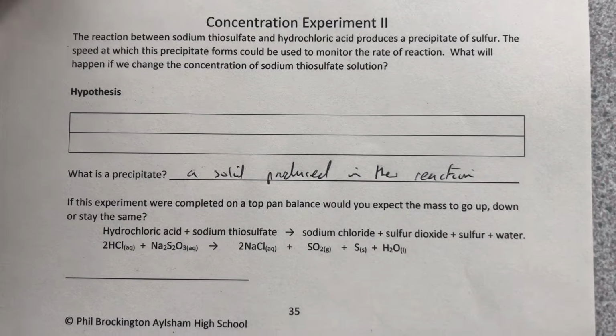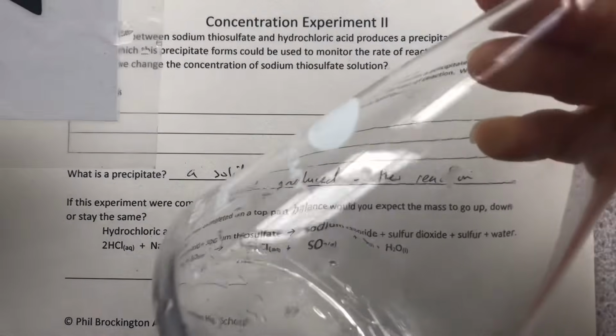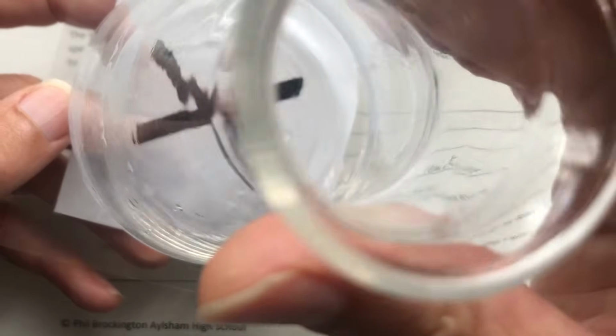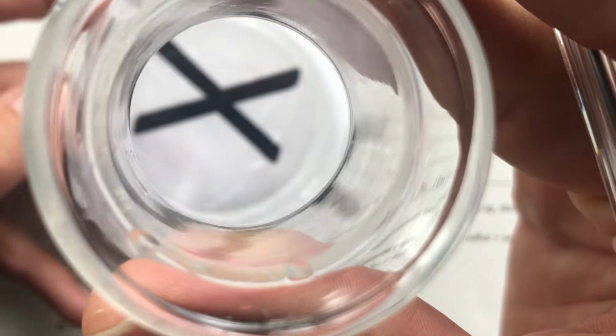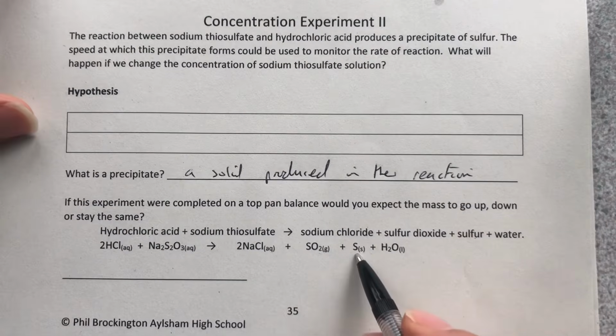So what we're going to do is put the reagents in a conical flask, one of these, and we're going to put that on top of an X like that, and we're going to look down through the flask, and when that X disappears, that X will disappear because of the sulfur solid produced.